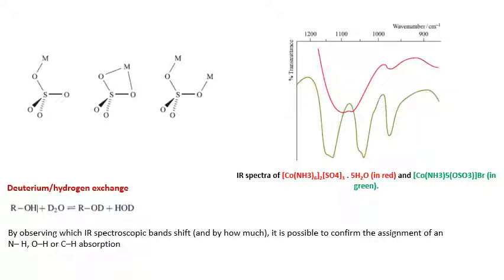So here I have shown the IR spectrum of an inorganic salt, which I will discuss right now. The inorganic anions, sulfate, nitrate, all these inorganic anions, when in the free state, not bound to metal, have a particular wave number, a particular vibrational mode. But when bound to metal, due to binding with the metal, the vibrational frequency changes. And also depending upon the binding nature, this frequency will also vary.